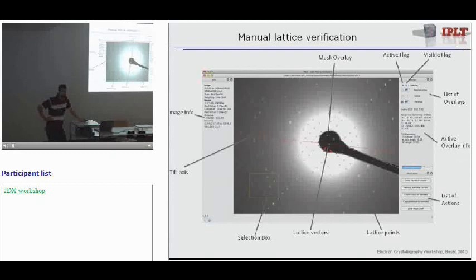So, I think if you wanted to use them, you'd have to take those three programs and just test them out on a few standard films. As far as we know, they're still fine. And there's one thing, which is the indexing on the highly tilted pictures, which again you said is tricky. Let's say it's a 60-degree tilt, and you don't quite know where the tilt axis is. There are often 2 or 3 possible indexing choices.